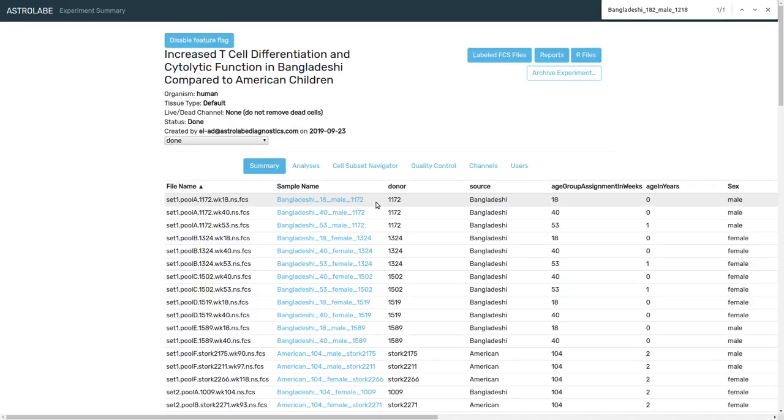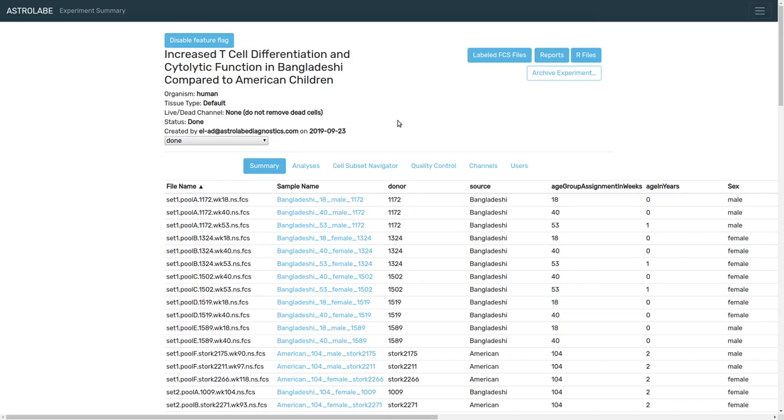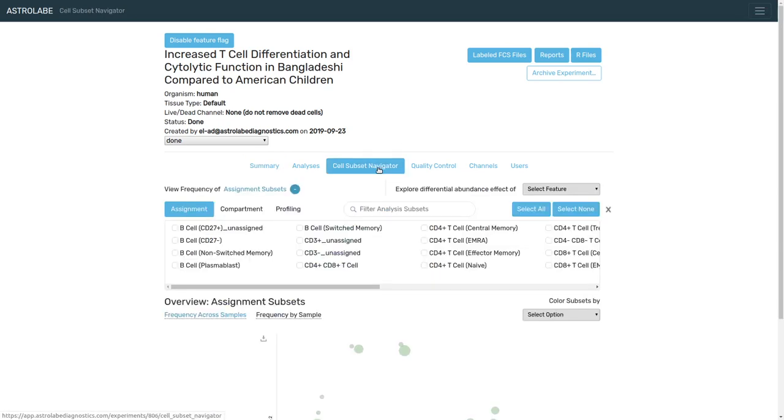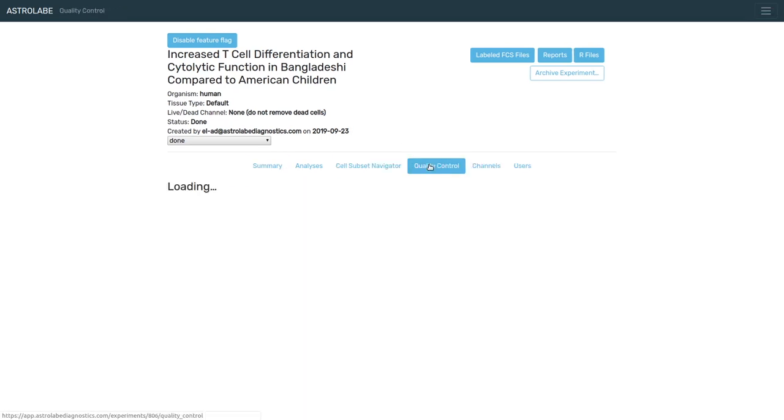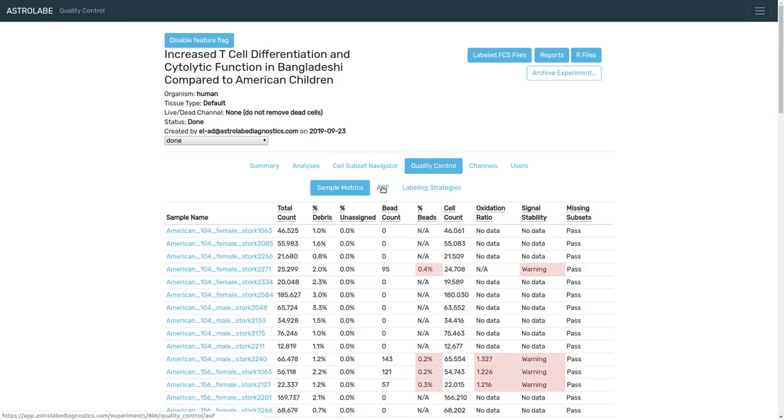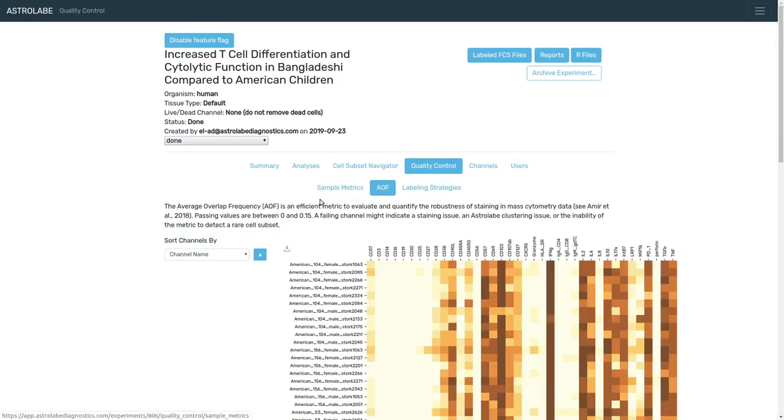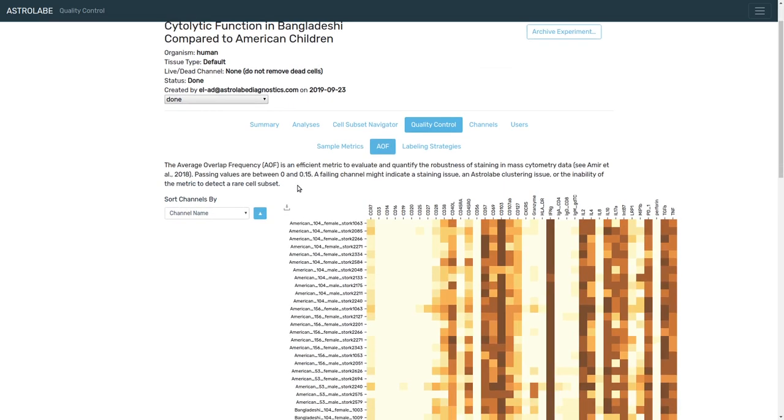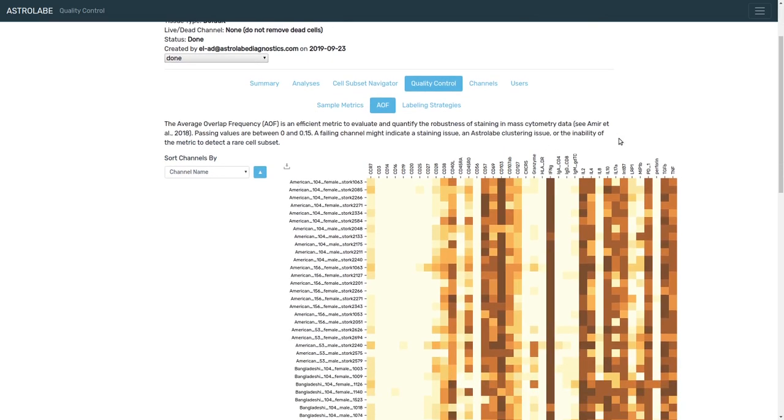The AOF is available as part of the Astrolabe cytometry platform. If you analyze your data using Astrolabe, you can go to the cell subset to the quality control tab and to the AOF tab, and that will provide you with a heat map that shows you the staining quality across all of the markers in your experiment.